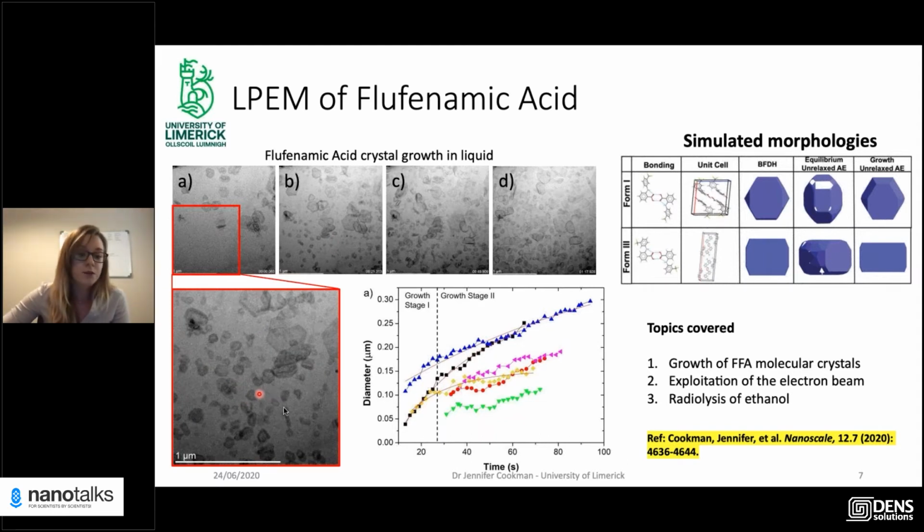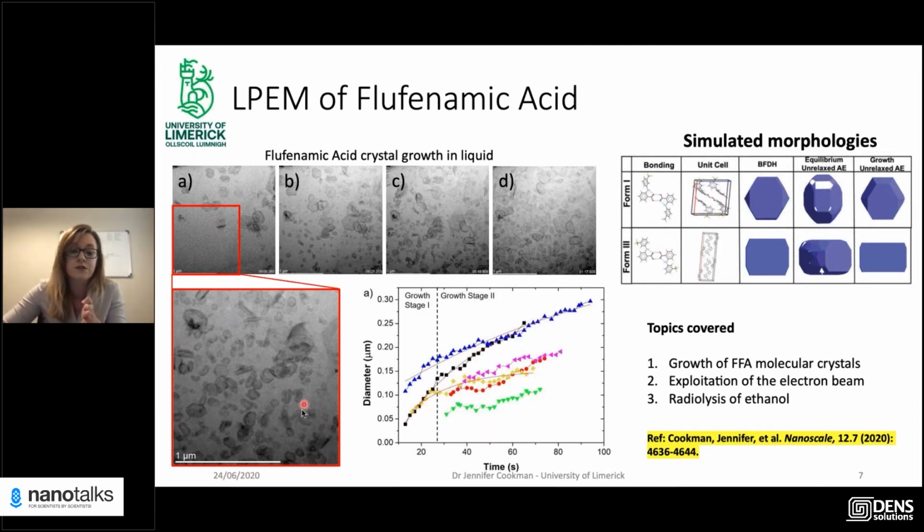We do observe some elongated structures, like I'm pointing out here in the video, but as you will see later on in the video, some of these elongated structures move, and you will see that they're actually the hexagonal shape. And the reason why we see them as elongated structures is on their side they do have a thickness, and this thickness, due to the diffraction contrast, is due to the faceting on the edges of the hexagonal crystal, as you can see is inferred in the simulations.